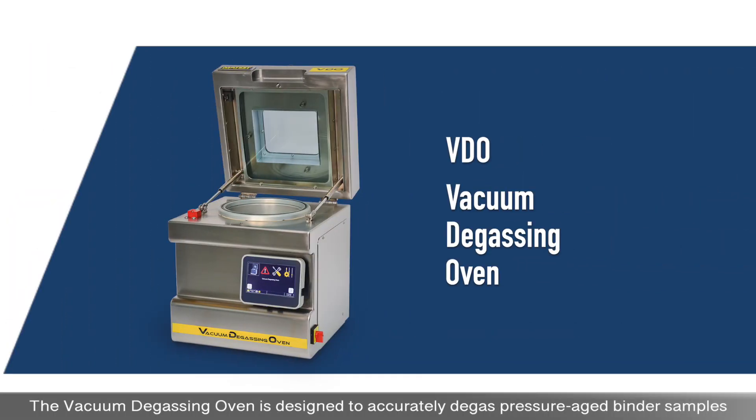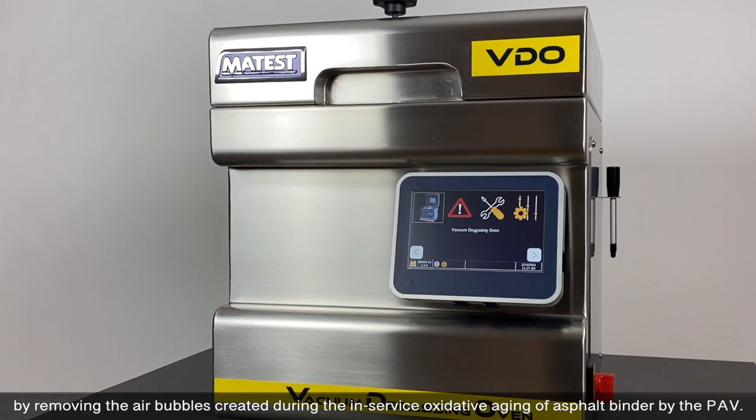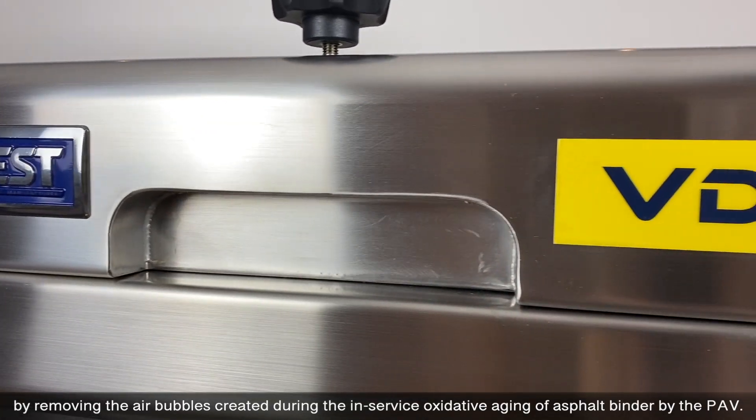The vacuum degassing oven is designed to accurately degas pressure aged binder samples by removing the air bubbles created during the in-service oxidative aging of asphalt binder by the PAV.